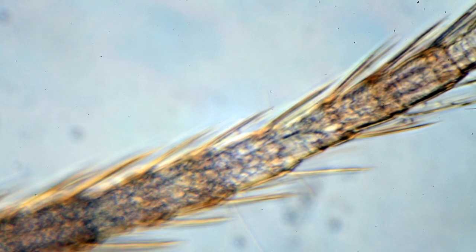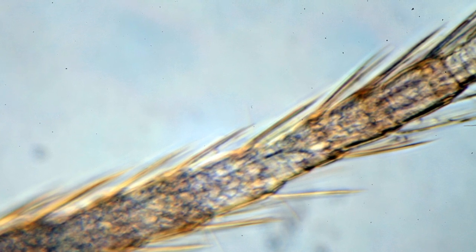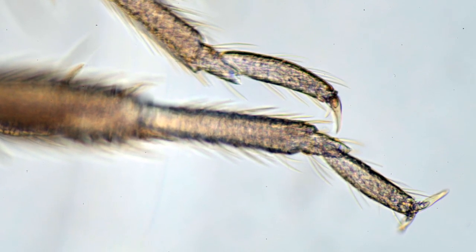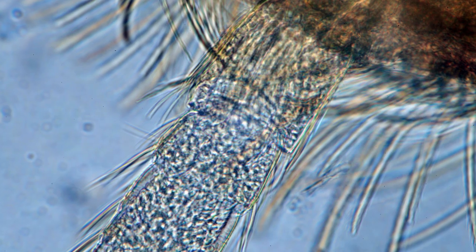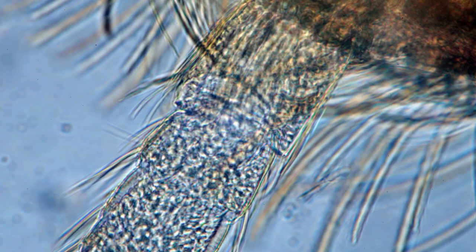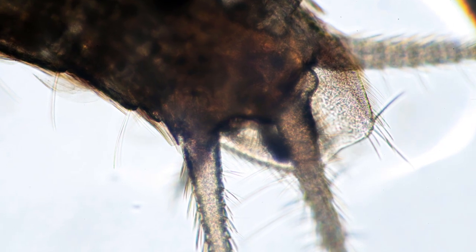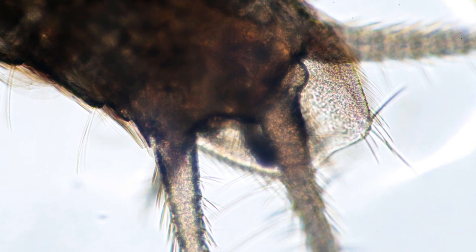This is a leg — it's a little bit out of focus but it was quite a high magnification. Over here you can see two other legs with the little feet they use to attach to surfaces. There's also a bright field image of one of the legs attaching to the exoskeleton of the insect, and now also a picture of the abdomen in bright field. You can see a whole bunch of little hairs — it's quite an interesting specimen.